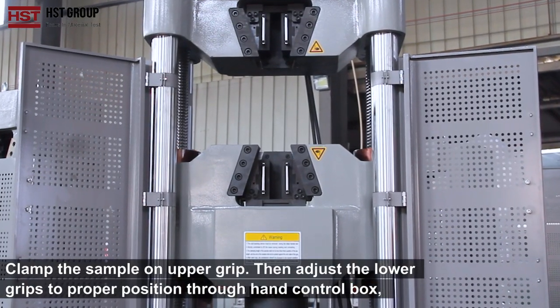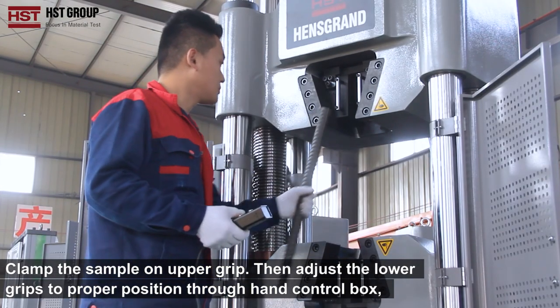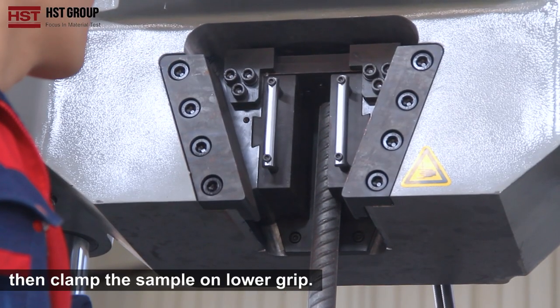Step 4: Clamp the sample on the upper grip, then adjust the lower grip to the proper position through the hand control box, then clamp the sample on the lower grip.